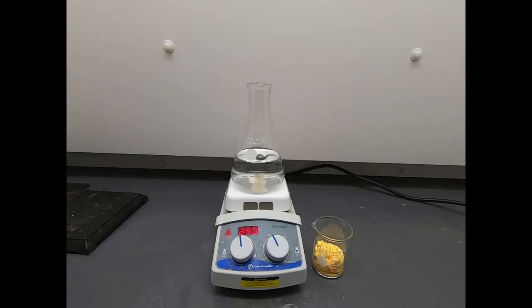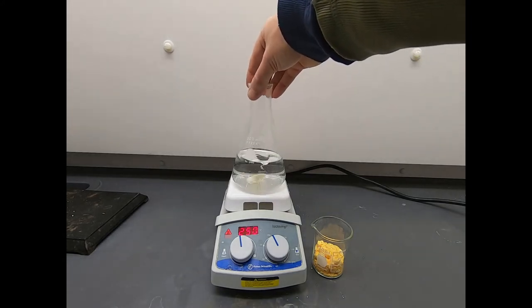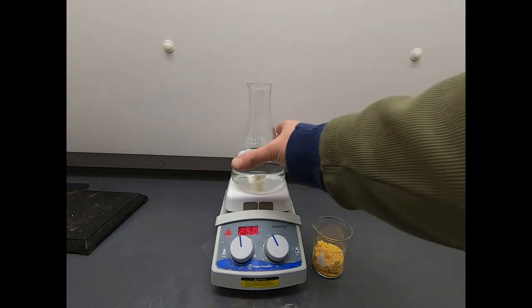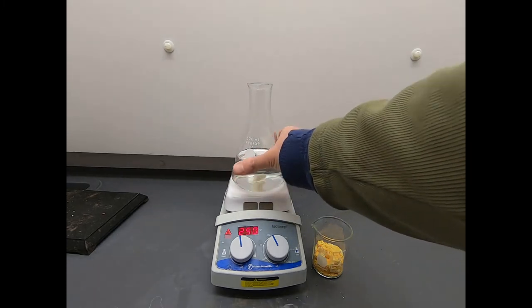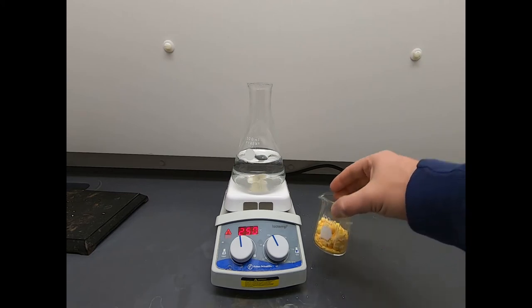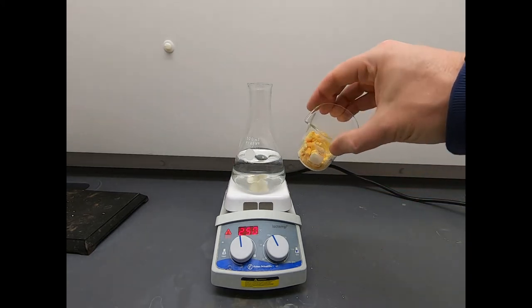Here is our recrystallization getting ready to start. Right here we have 300 milliliters of water. It's just regular distilled water, and we're heating this up to boiling. The hot plate is at 250 degrees, so it should heat up before too terribly long. It's getting uncomfortable to touch, so that's a good sign. And right here, the star of the show, this is our N-bromosuccinimide.